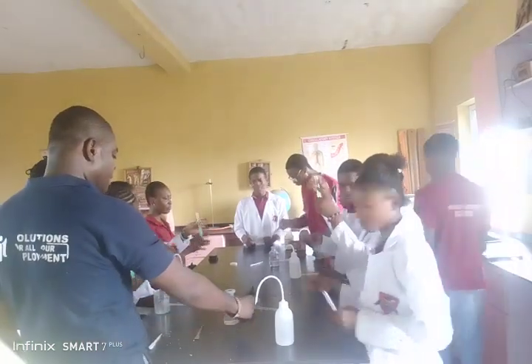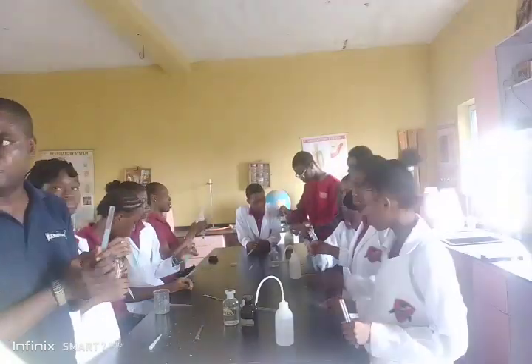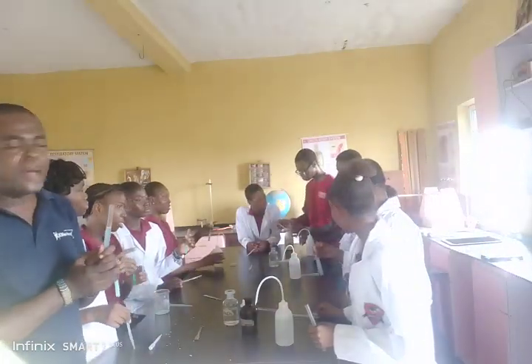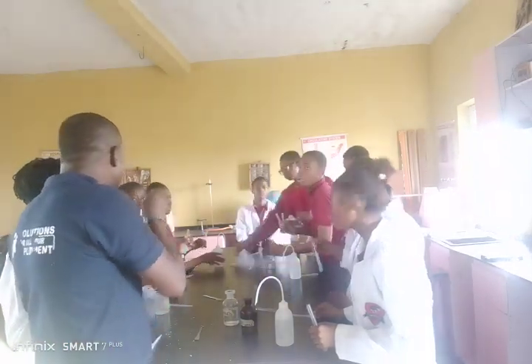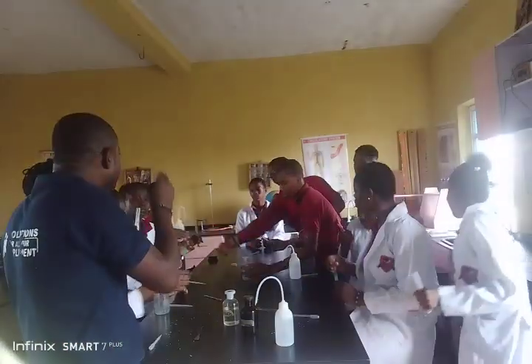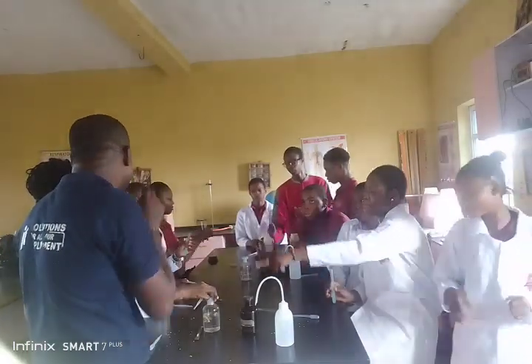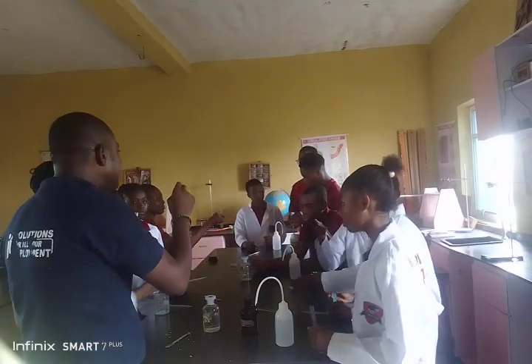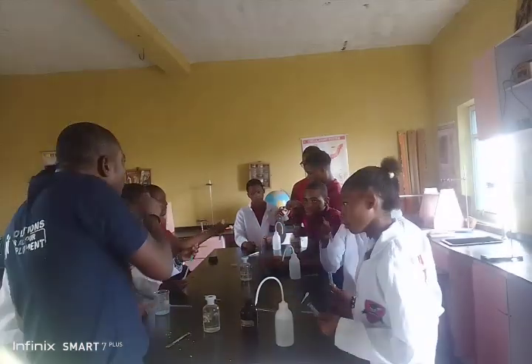Yes, we are here with the second portion of solution C, add HNO3 followed by AgNO3. I told you anytime you are seeing HNO3 followed by AgNO3, you are going to get a white precipitate which tells you chloride ion. Am I talking to you? Yes, because the AgNO3 will react with the copper 2 chloride to form silver chloride.